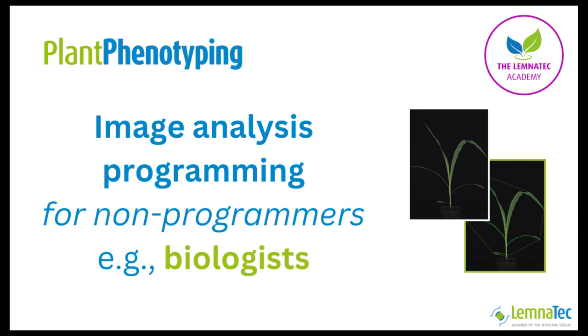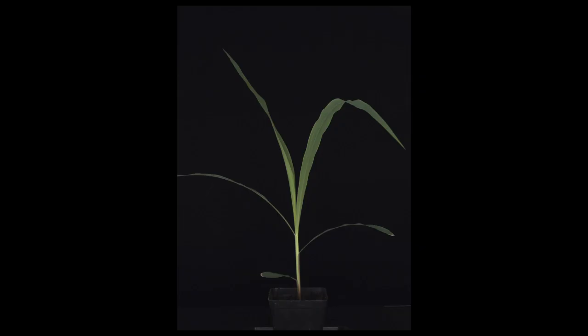So a typical situation. A biologist is doing phenotyping. The biologist records the images and now they should get analyzed. What to do? In the LemnaTec software suite, there is LemnaGrid, and with LemnaGrid also biologists or other non-programmers can work on image analysis programming. Let's have a quick look how it works.